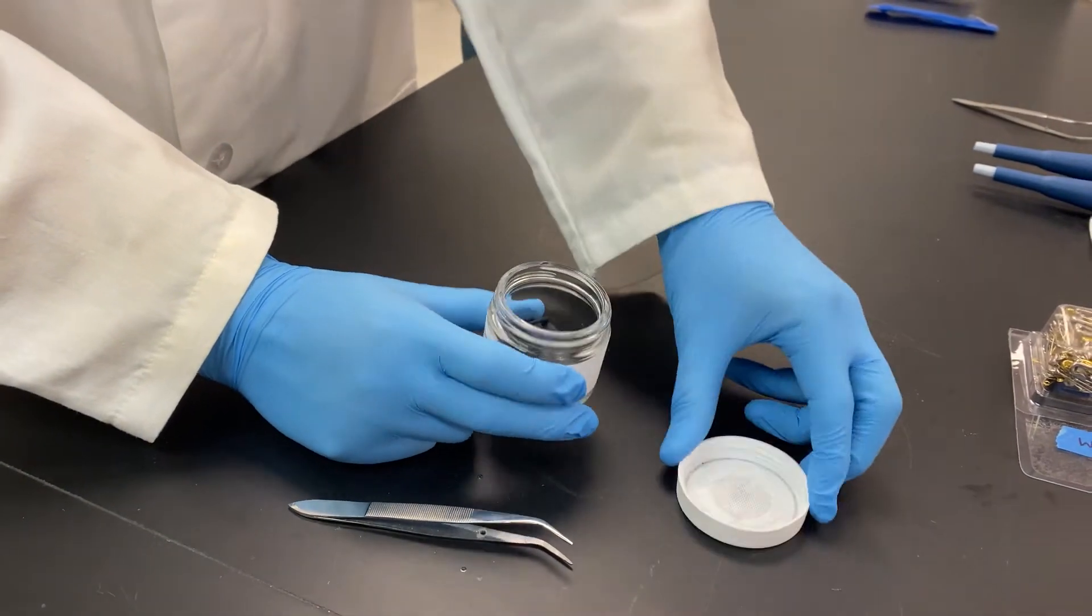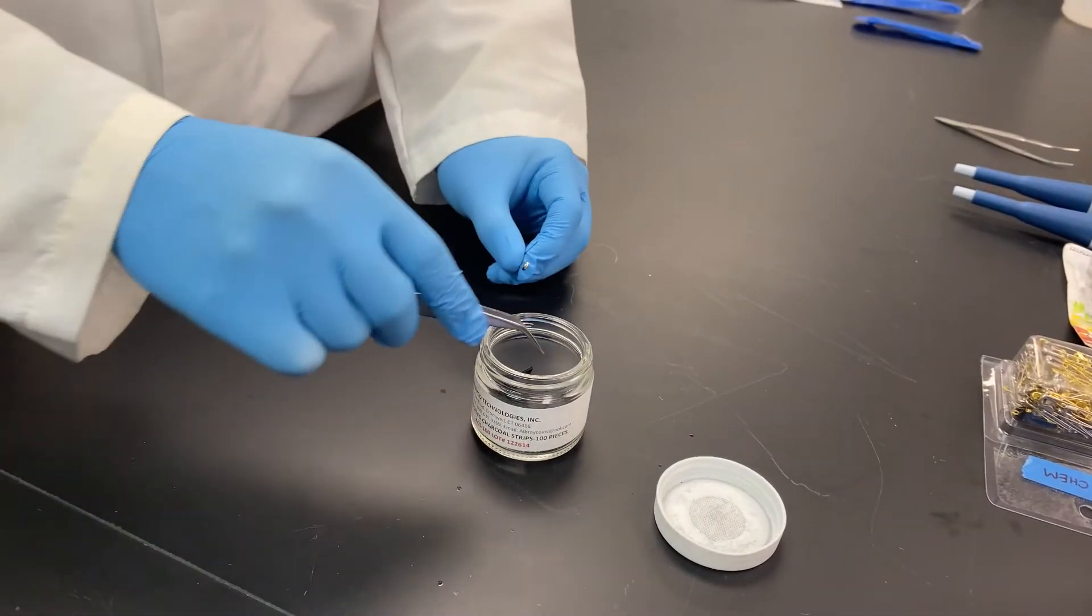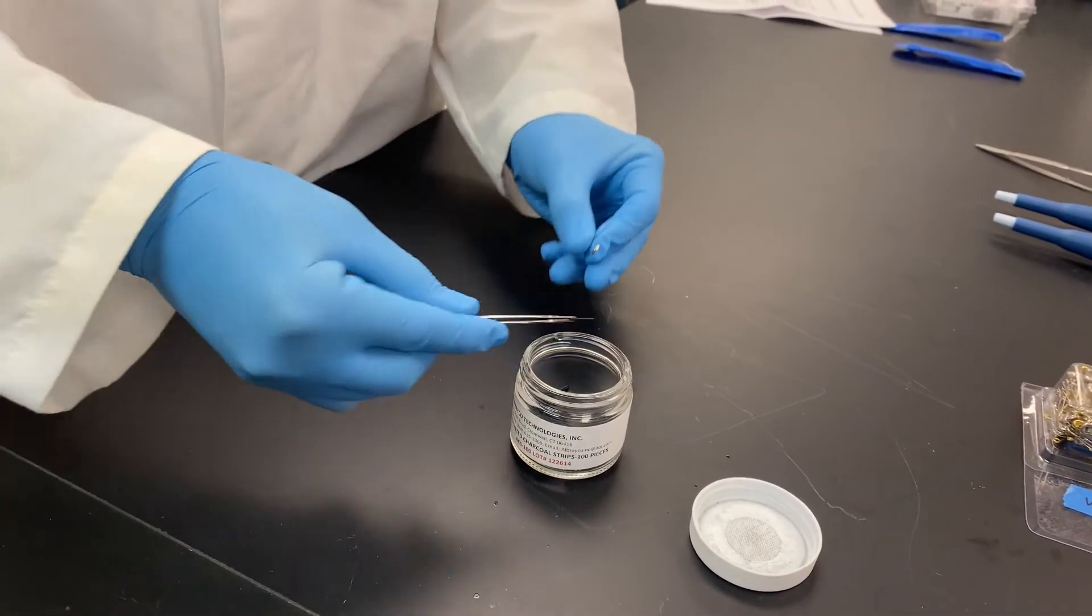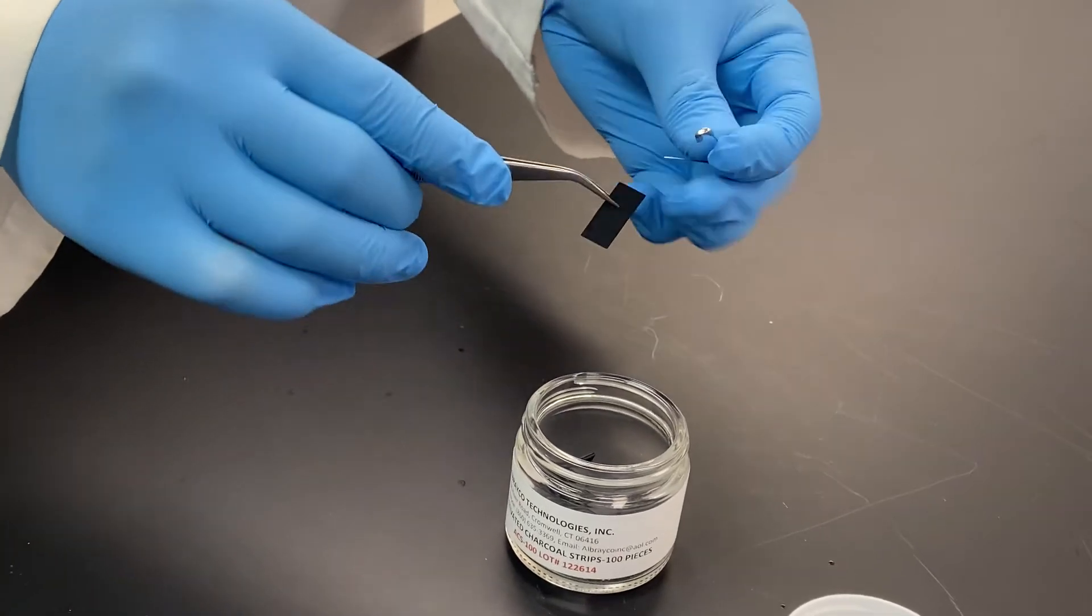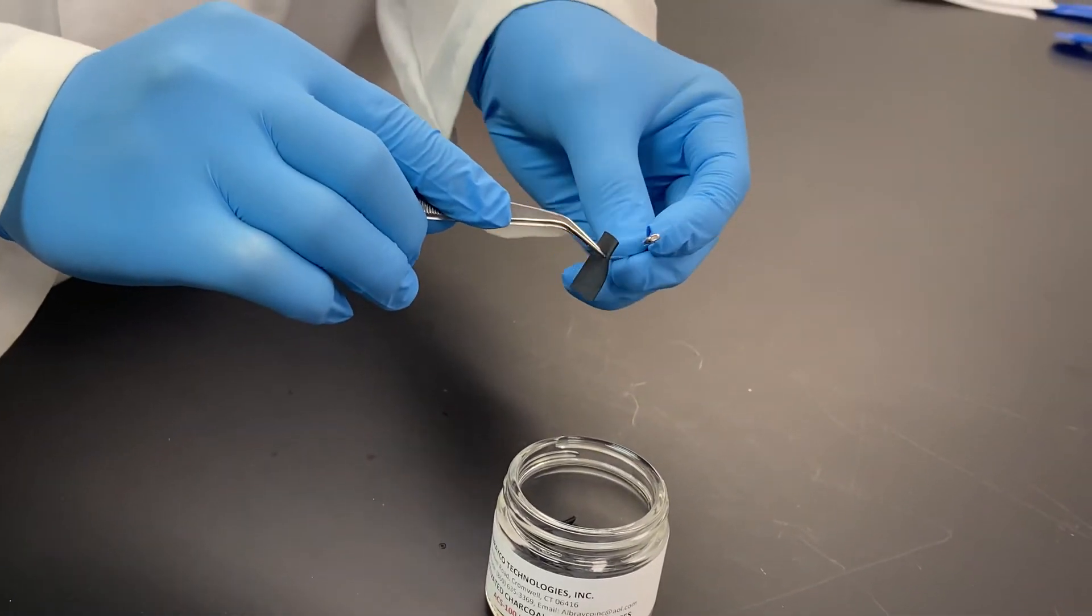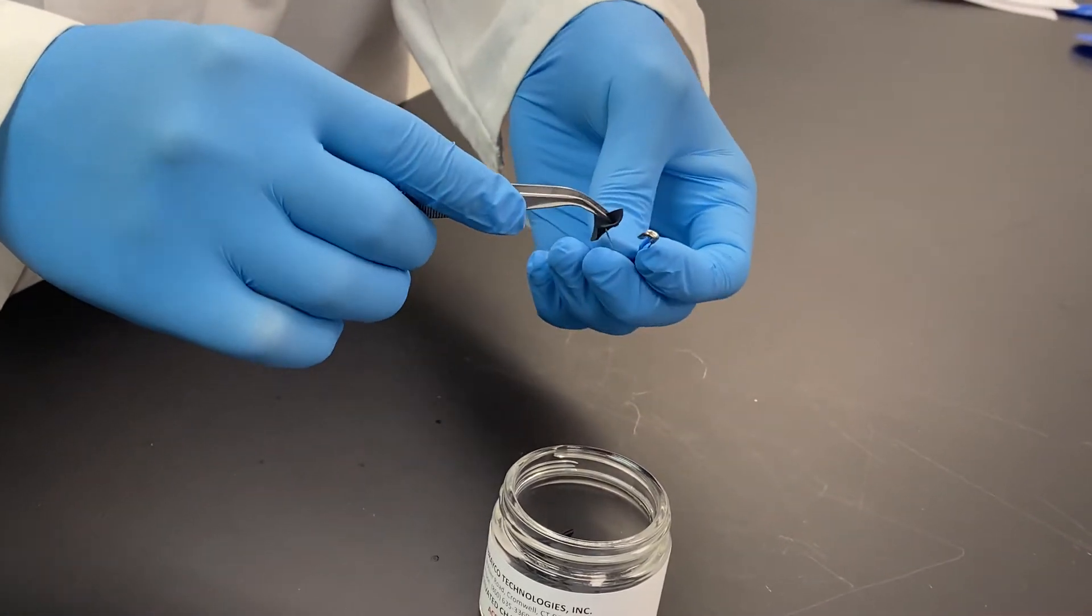First, pick up your activated charcoal strip using your tweezers. Only handle the strip using these or clean gloves. Now, open the safety pin and stick it through the activated charcoal strip. Make sure that it is secure.